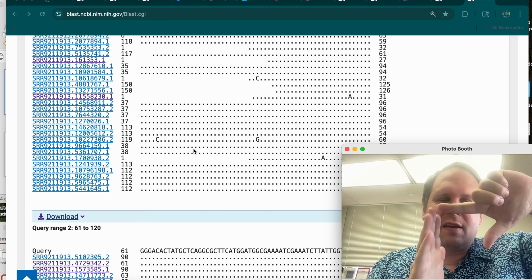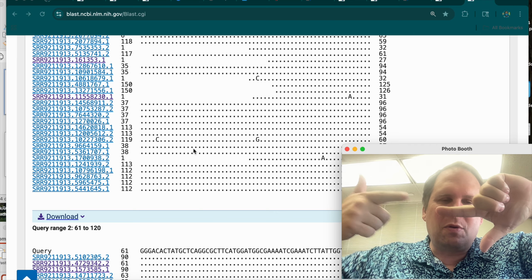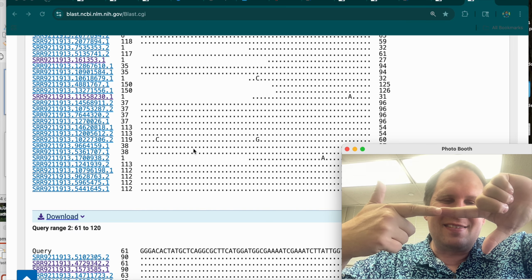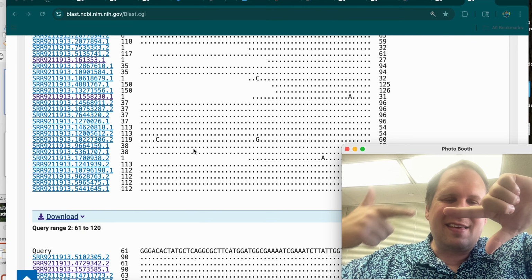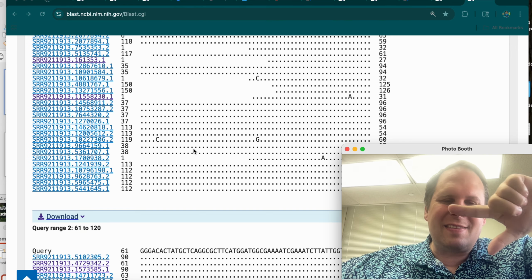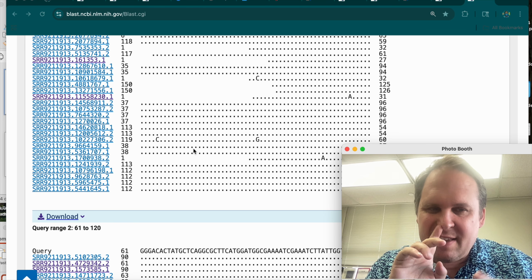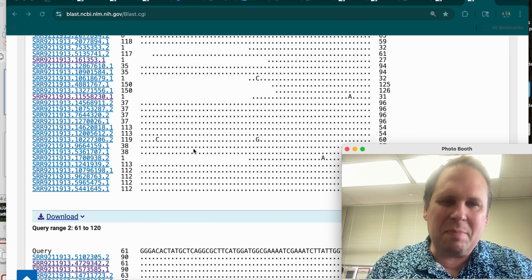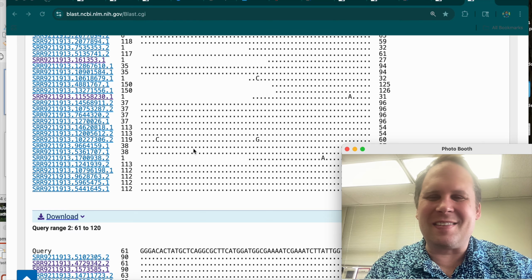If we find one with a reverse end here, we know there exists a forward end somewhere near or far to this. And so every time we click a reverse, we get a chance at a different forward. And if we get several of these things, we can build several steps at once. This is only how you go fast. If you cannot get your head around that, click a forward read, move 7 bases at a time, and by the end of 300 searches, you will be done. This is only an efficiency thing.